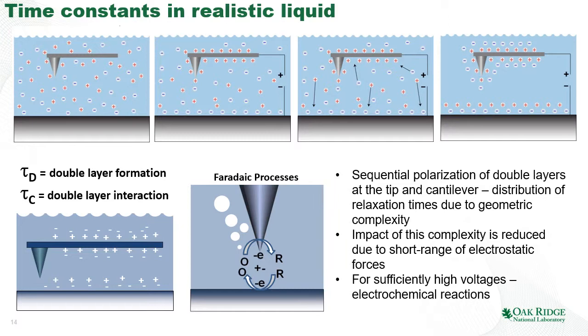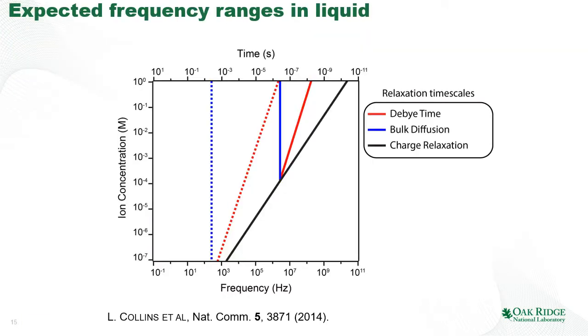We can speculate that the reaction will happen on time scales comparable or slower to the diffusion time scales, but if you apply higher voltages, then your transport mechanisms are going to change. So for high voltages, we will have a transition from the diffusion of ionic species to the electromigration of ionic species. So this basically makes life complicated, and it illustrates that there are multiple phenomena possible on the time scale of the SPM measurement.